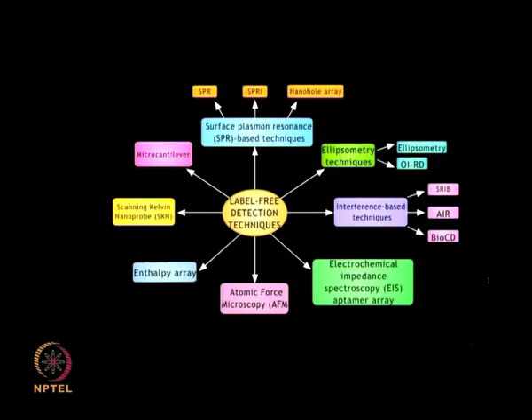Microcantilevers, these are thin silicon based gold coated surfaces that hang from a solid support. Bending of the cantilever due to surface adsorption is detected either electrically by metal oxide semiconductor field effect transistors or optically by changes in angle of reflection.